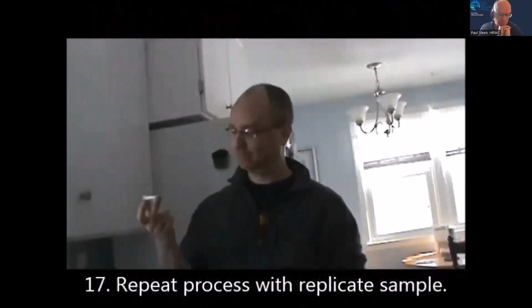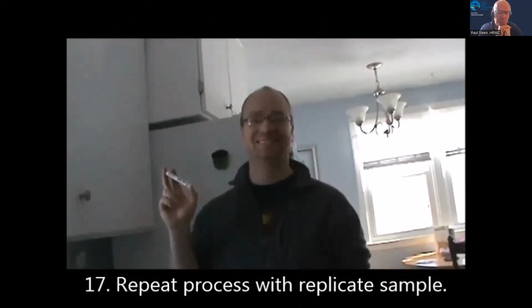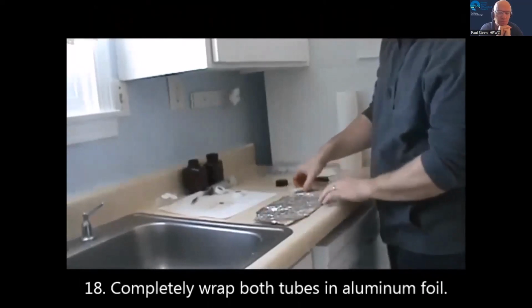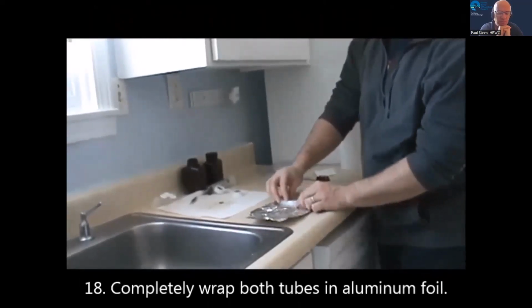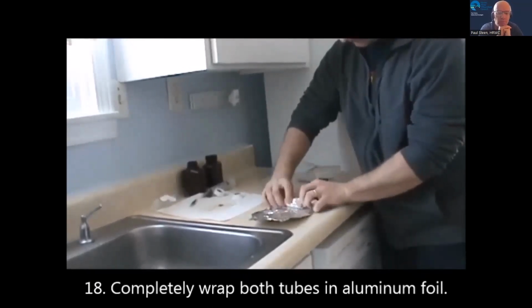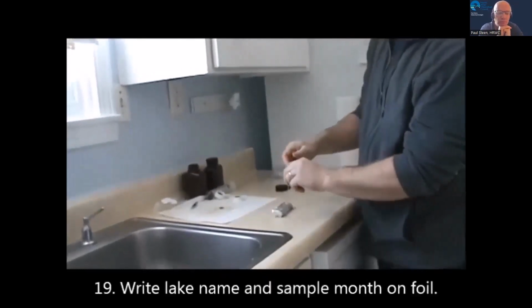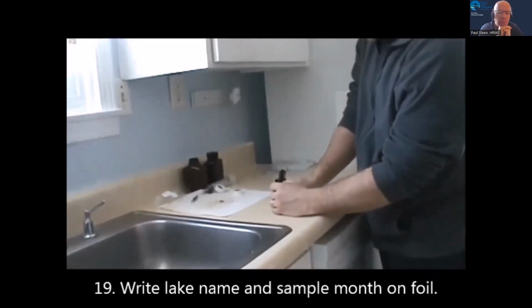You now have one sample complete. Congratulations! Now you get to do it all over again with your second sample bottle. Once both samples are complete, wrap the vials completely with aluminum foil to keep all light out. This foil wrapping step is critical. Unwrapped samples cannot be accepted for laboratory analysis. Write your lake's name and the sample month on the foil packet.